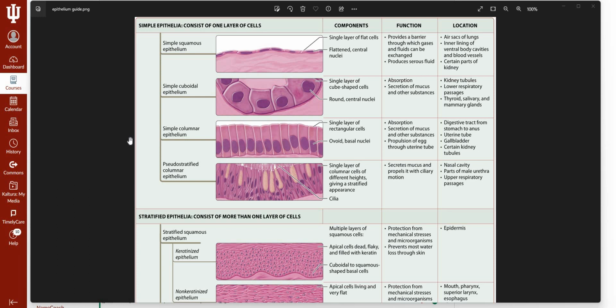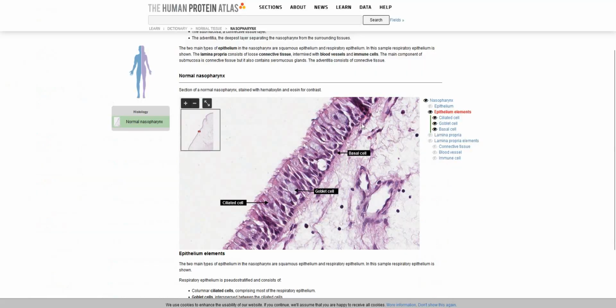So one big concept to know as we work through future units is we're not going to see just one type of tissue, and the respiratory tract is a great example. We are dealing with connective tissue and epithelium, and you'll need to know the difference on a slide so that you can navigate the organ systems that we look at. So these basement membranes are going to be really helpful for that, but we'll continue to work through that and have that big concept be a major theme with all the histology that we look at.